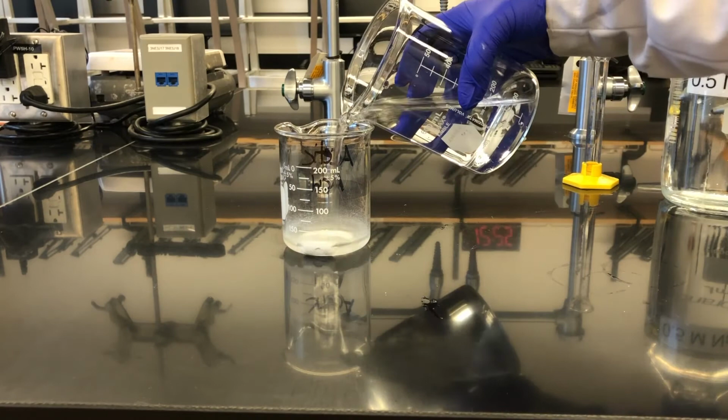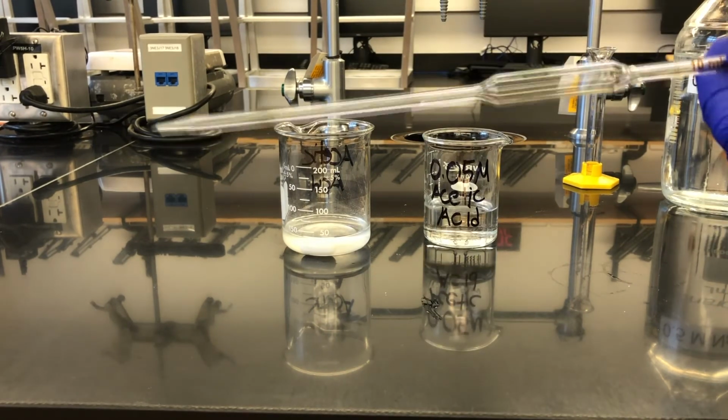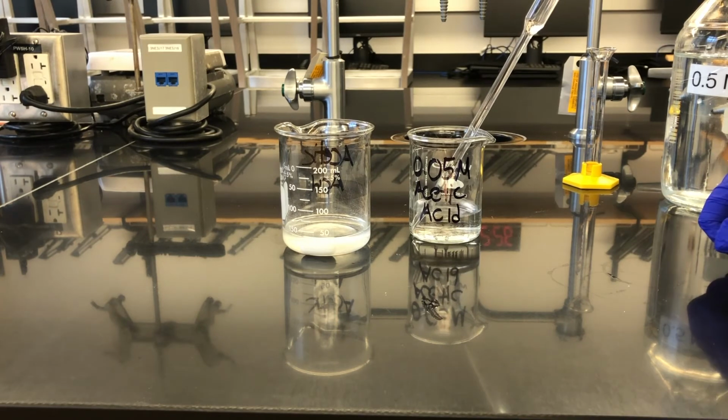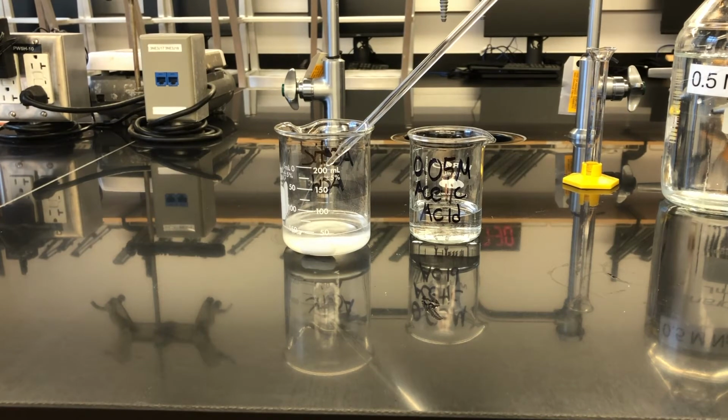Finally, before performing the titration, we prepare the solution that we'll titrate into by measuring approximately 50 milliliters of deionized water into a 250 milliliter beaker. Then, using a 10 milliliter volumetric pipette, we add 10 milliliters of the prepared 0.05 molar acetic acid solution. Next, we add a stir bar, place the beaker on the hot plate, set up the burette and pH probe, and begin data collection.